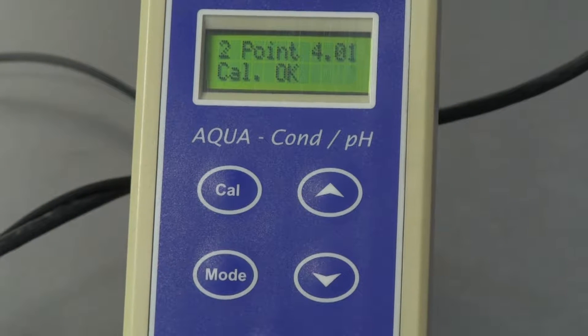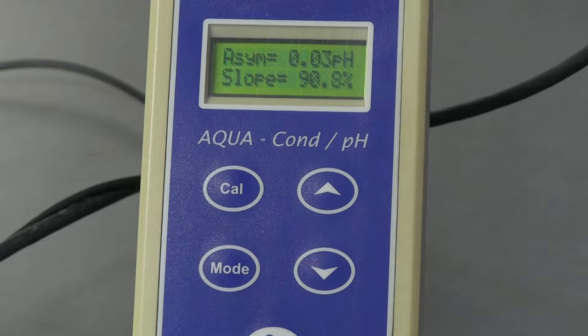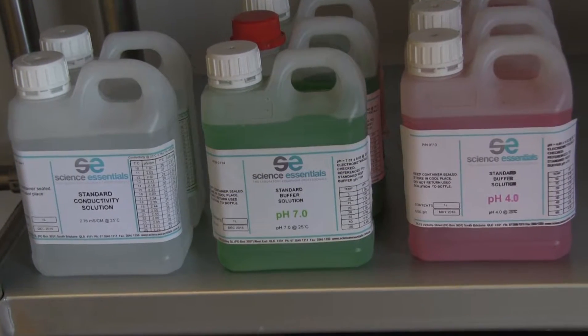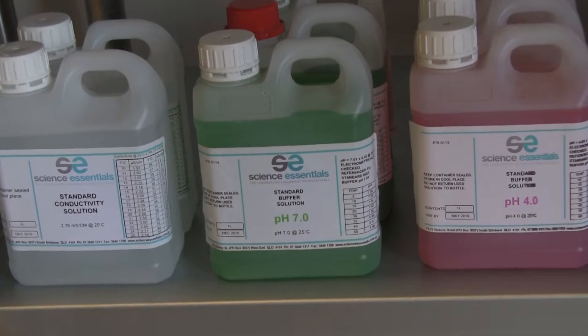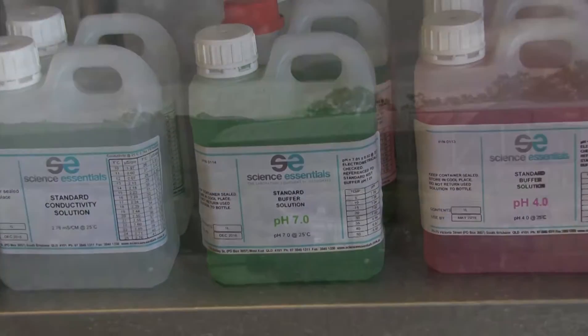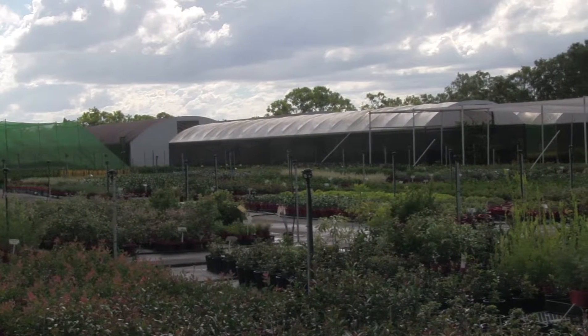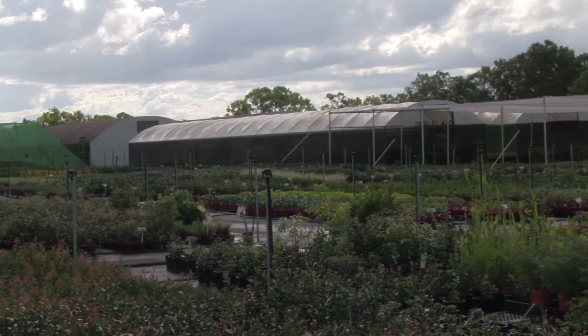Calibrating the unit against two pH buffers, known as a two-point calibration, will provide sufficient accuracy for most nursery situations. pH buffers of 4, 7, and 10 are the most common calibration buffer solutions. But for most nursery situations, a pH 4 and a pH 7 calibration will cover most commonly encountered pH readings.